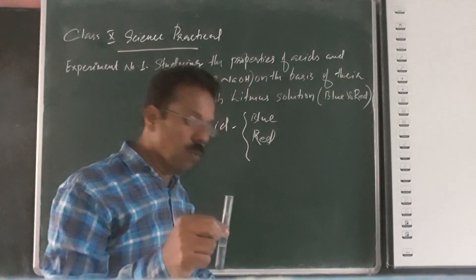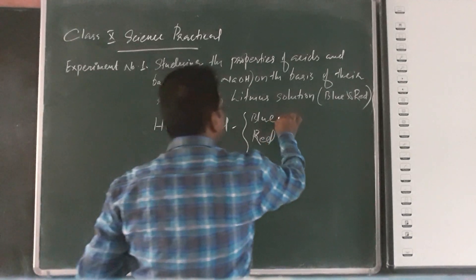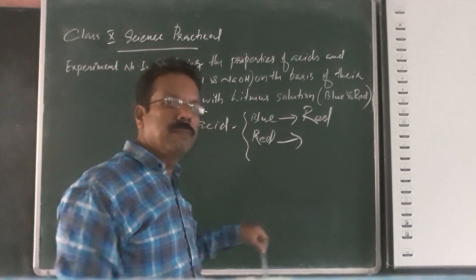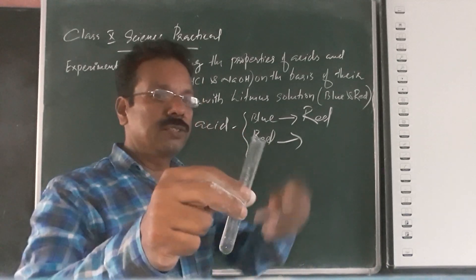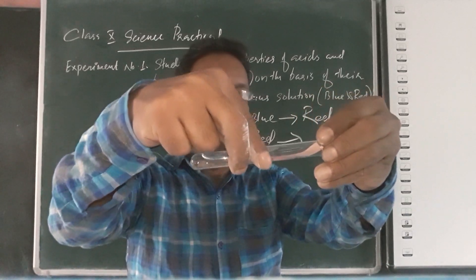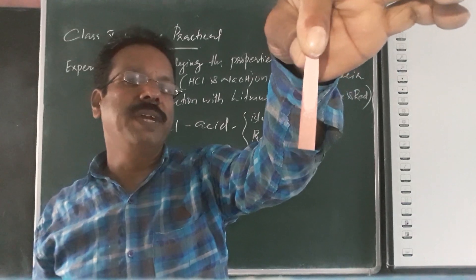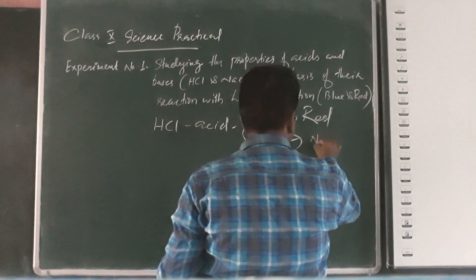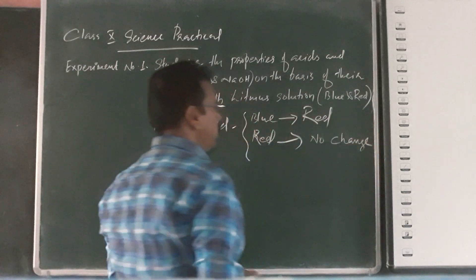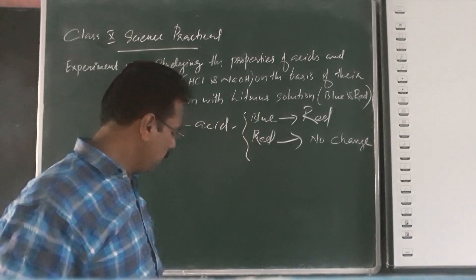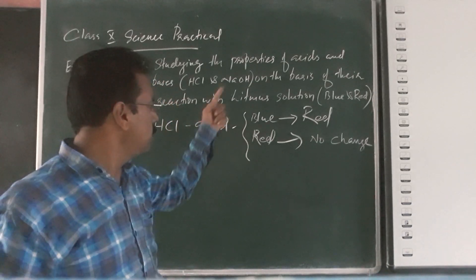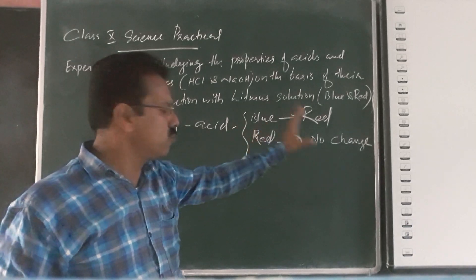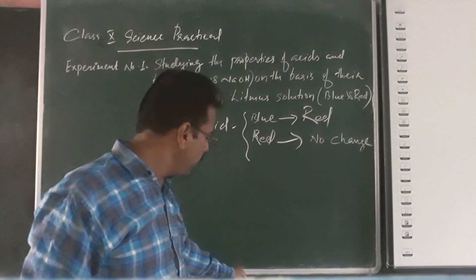In acid, the blue color changes to red — blue litmus changes to red. Then, in the same acid solution, we dip the red litmus. Any color change? No, only a wet appearance — no color change. So, if you are testing an acid with blue and red litmus: if the blue changes to red, that solution is an acid. Red litmus shows no change in acid.